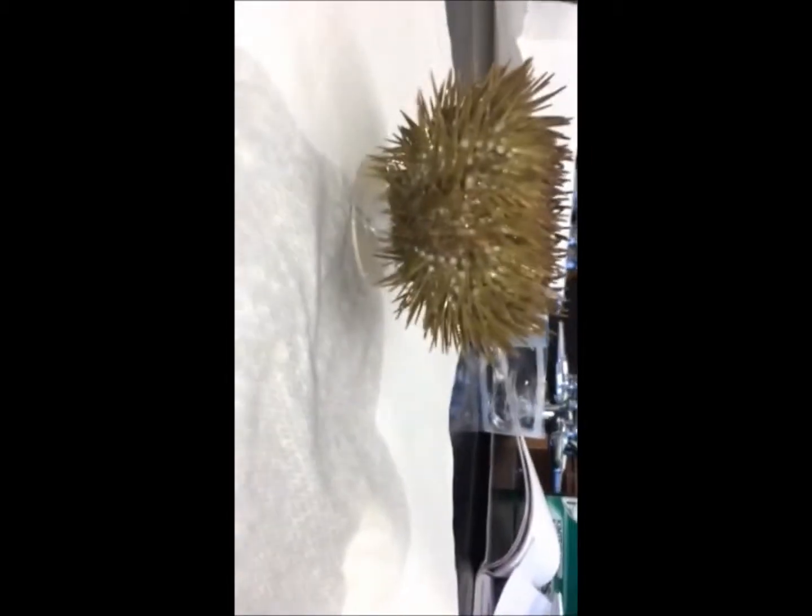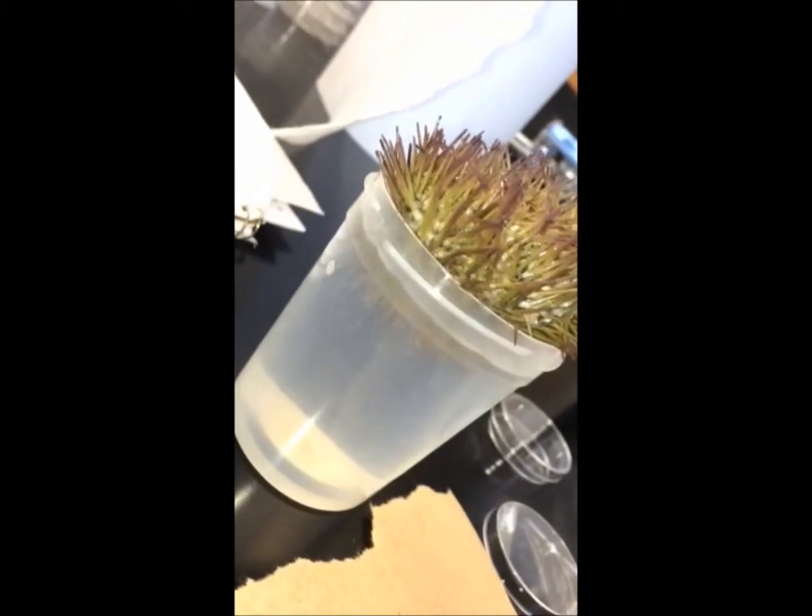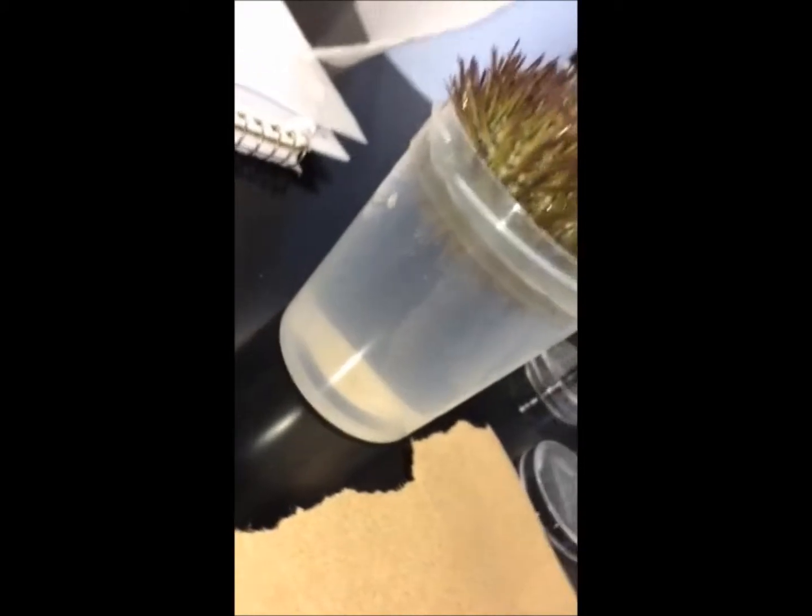So that looks like a dude — look at the deposits. And this one appears to be a female depositing her eggs.